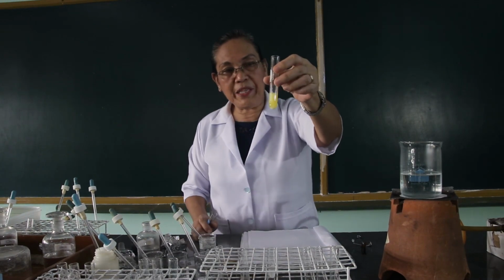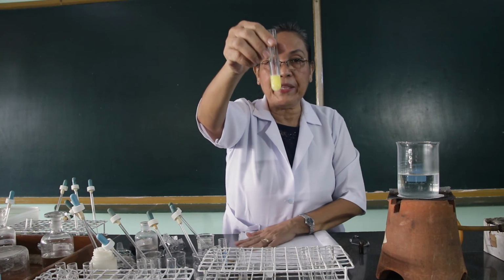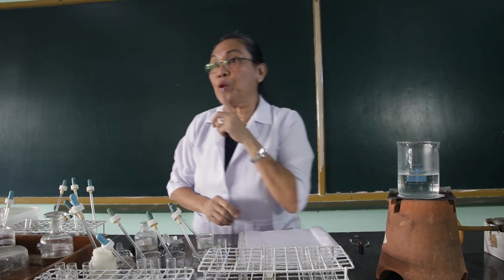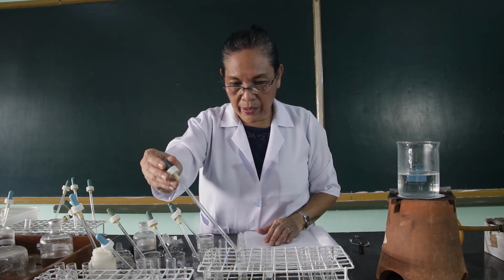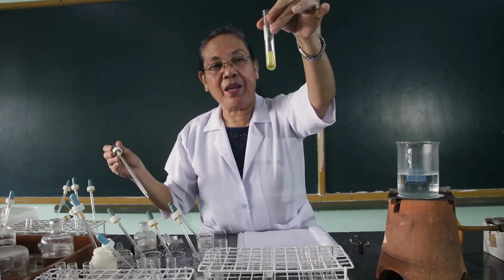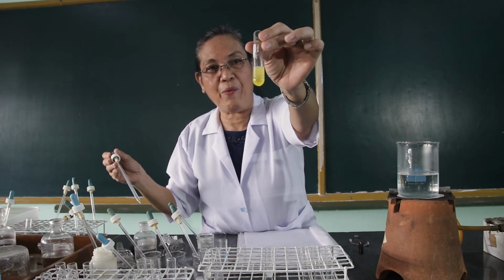Having seen the precipitate, let us decant the liquid part. Then to the precipitate, we're going to add 5 drops of the hydrochloric acid. I want you to observe what happens. Observe what happens to the precipitate that you have found at the bottom of the test tube a while ago.